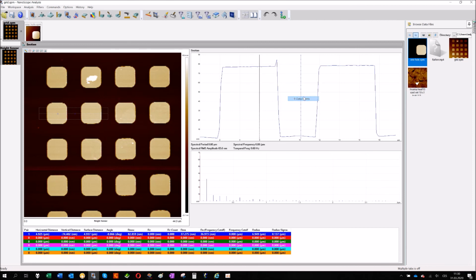If I just click the 9 data points, you can see that right now I have 2 cursors which are actually 1, and we are averaging the 9 points between these 2 cursors and calculating with 1 number, comparing to the second cursor, which could also be 2 markers which are averaging a few points. So you can add more points, for better statistics, better results, a better idea about it.